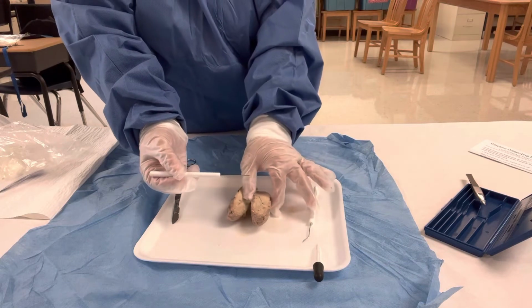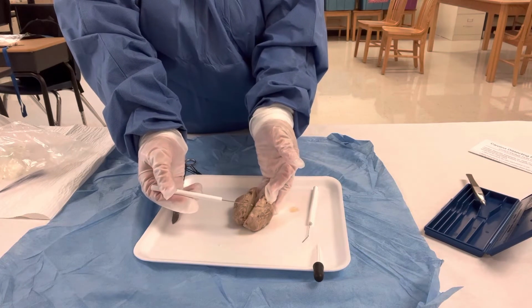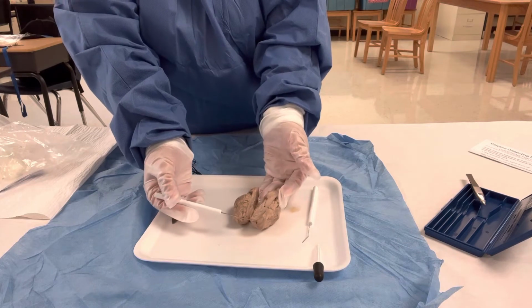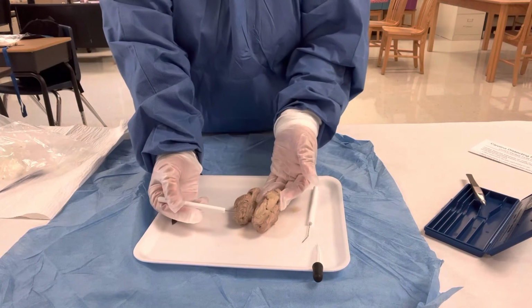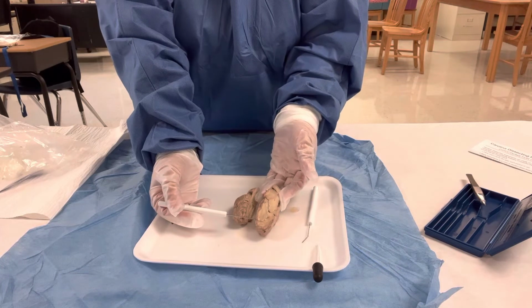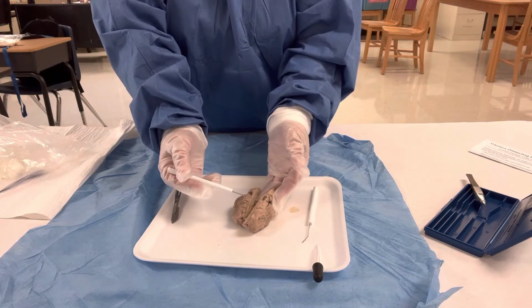Oh, the lobes. So you have that was the frontal lobe, and it plays a part in smell plus dealing with motor function. You have the olfactory bulbs, which is right here. It controls sense of smell. You have the optic nerve, which transmits visual info to the brain. The parietal lobe handles all sensory information except vision, hearing, and smell.